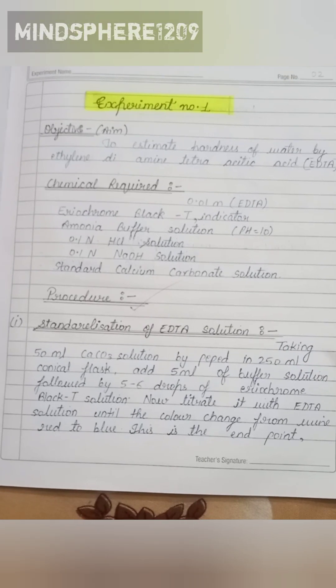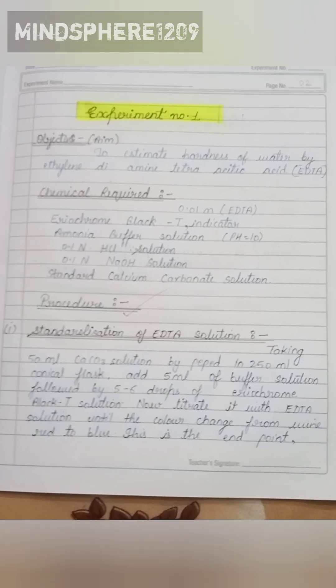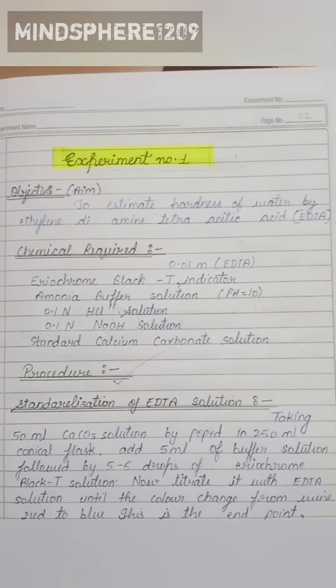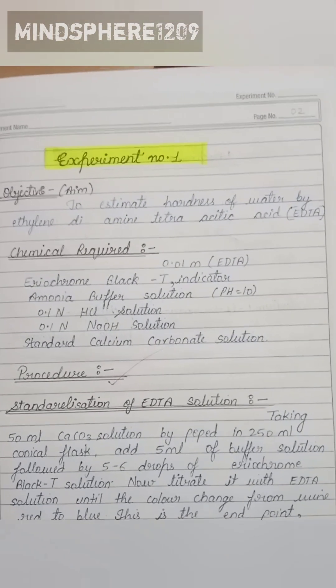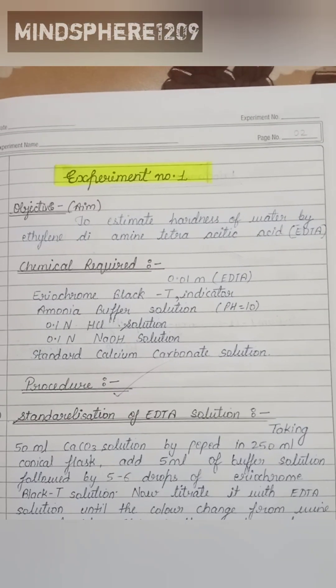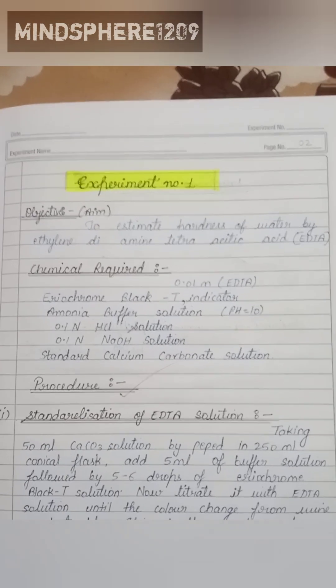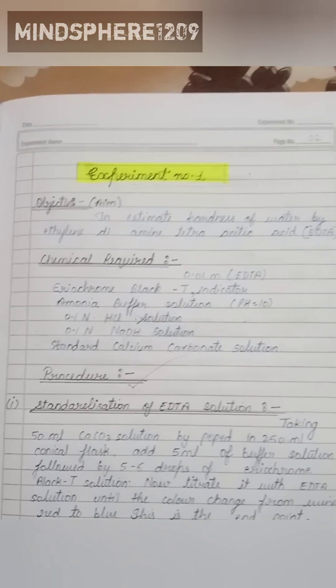We add 5 ml of buffer solution by dropper, then add a few drops of Eriochrome Black T solution, and then titrate with EDTA solution until the color of the solution changes from red to blue. This is the end point of the first step.